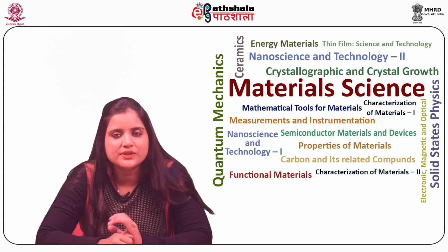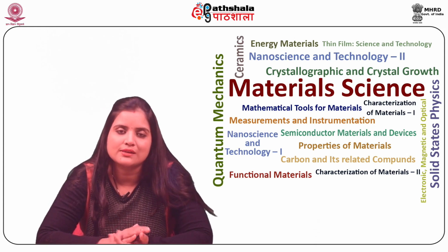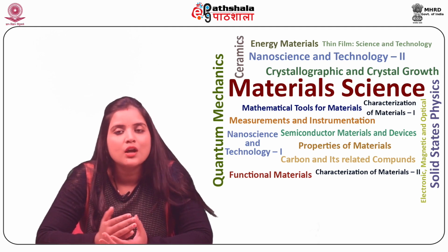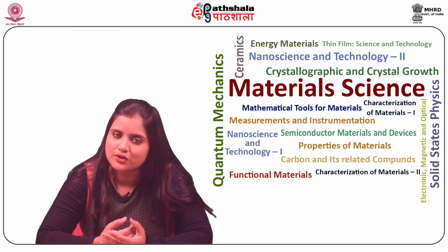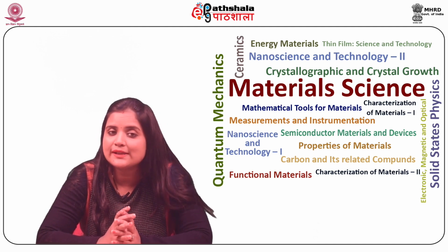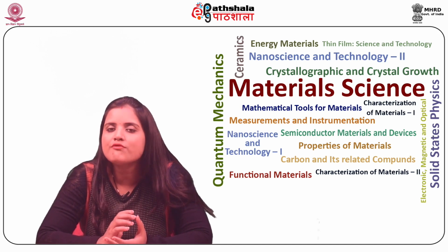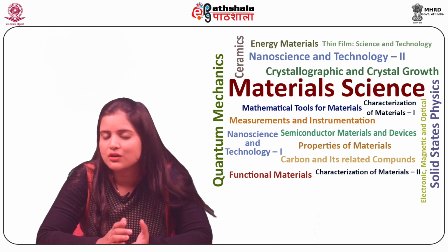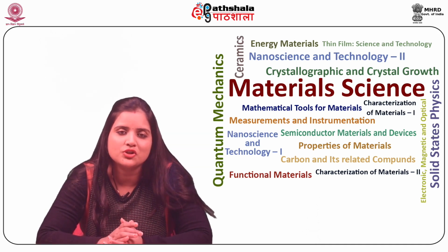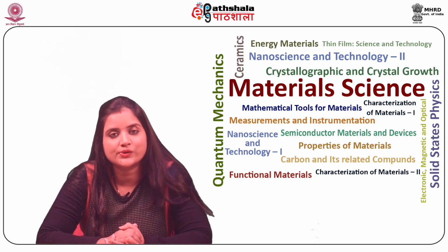The samples investigated can be solid, liquid, and gas. STM can be operated in a wide temperature range from 0 Kelvin to a few hundred Celsius. Lateral resolutions of the order of 0.1 nanometer and depth resolution of 0.01 nanometer can be obtained using scanning tunneling microscopy.